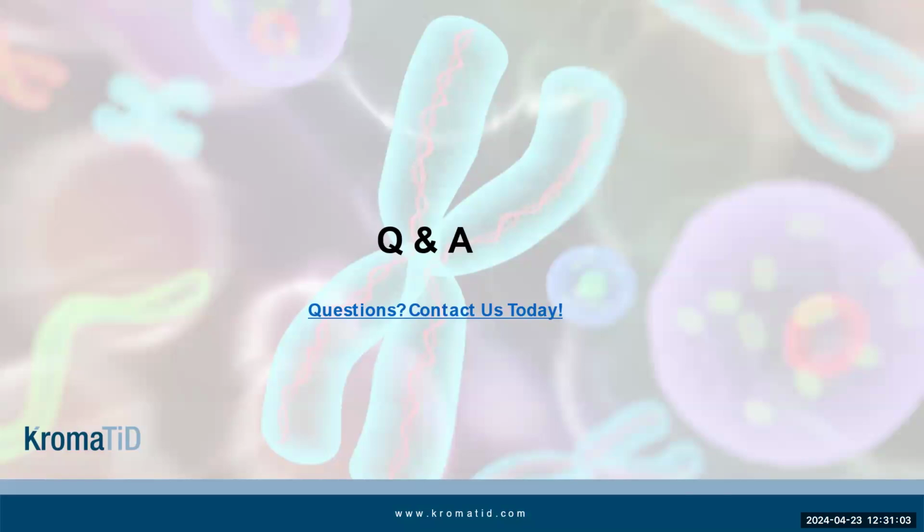And as far as the beta testing opportunity, the one thing I would like to add also is that the DGH assay is pretty much just a FISH assay. It's going to be using all the same hardware and reagents and everything. The one different step is that UV exposure, but we can even work with folks if they have needs regarding the hardware for that.